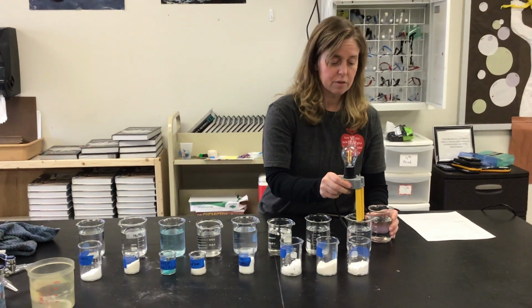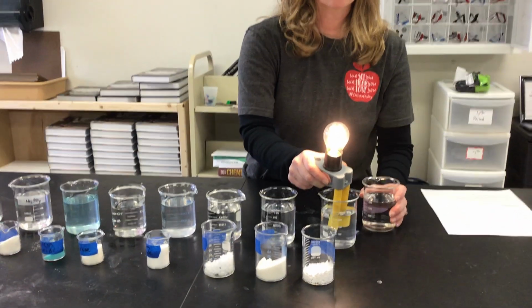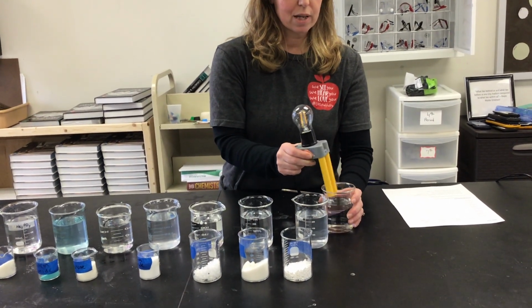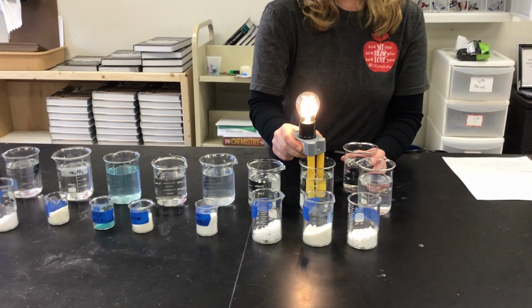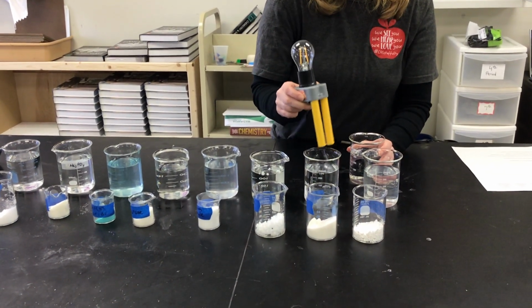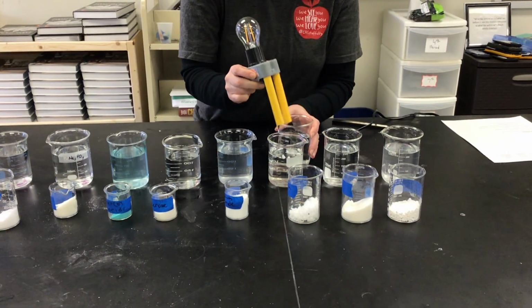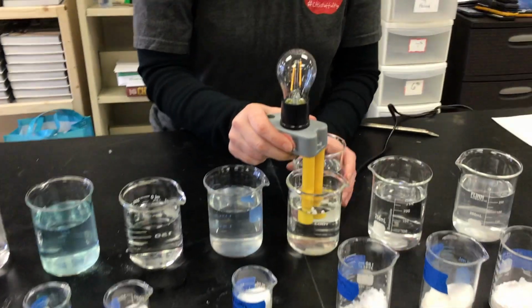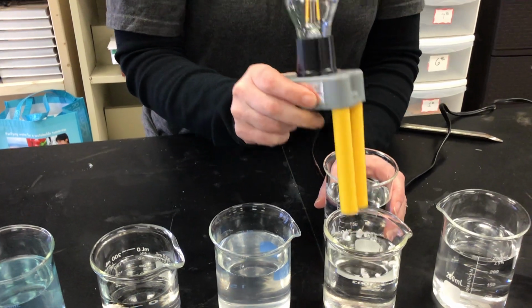So I'm going to stick it in here. This is the calcium chloride, the first one. Woo, that's very bright, it does, right? Yeah, great conductivity there. Okay, so we'll rinse that off. Move to the next one. Great conductivity there. Okay, so that's number 2. Okay. And nothing on number 3. No conductivity. Let me zoom in on the filament so they can see that. Y'all see nothing happen?